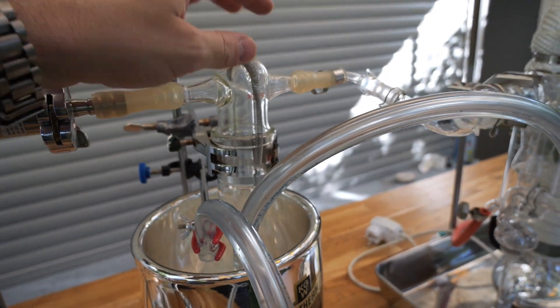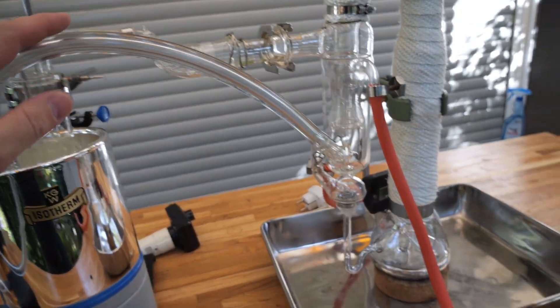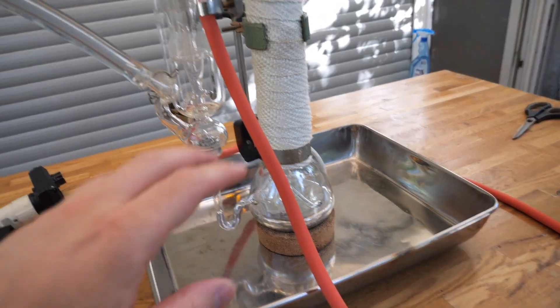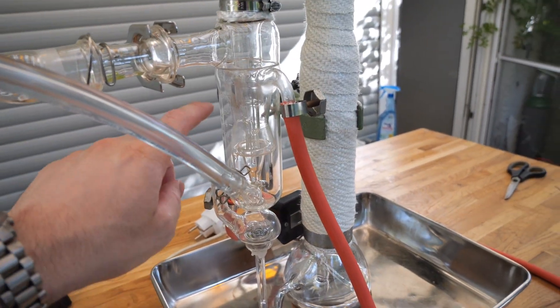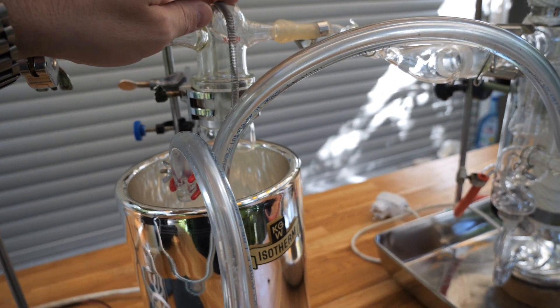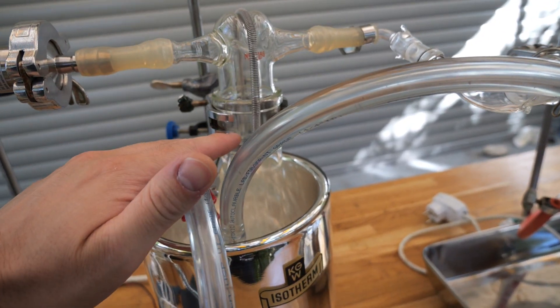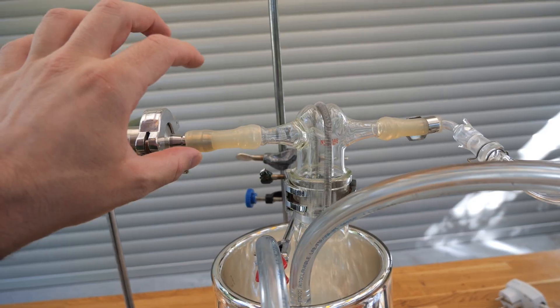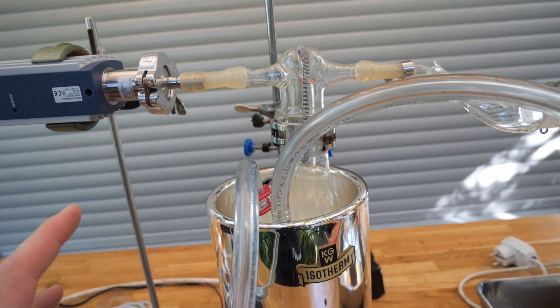This cold trap here is very important. Without it your vacuum would be limited by the vapor pressure of mercury at room temperature, basically, or the temperature of the cooling water. This cold trap basically eliminates the vapor pressure of mercury because everything condenses in here. And at the other side your high vacuum system, whatever you want to use, is connected.